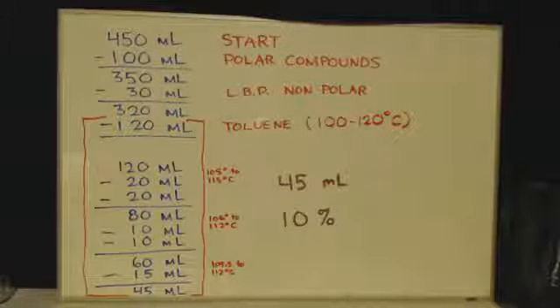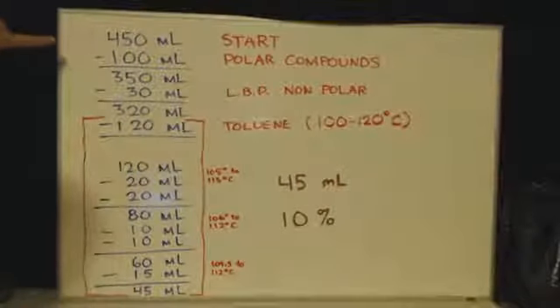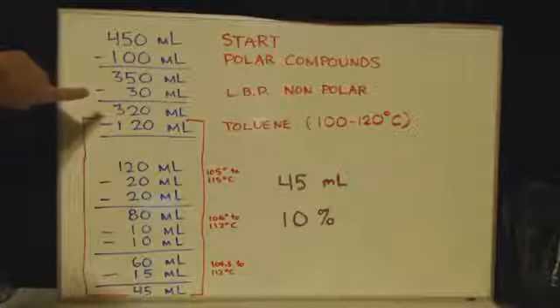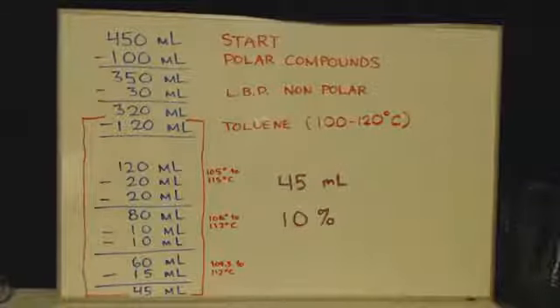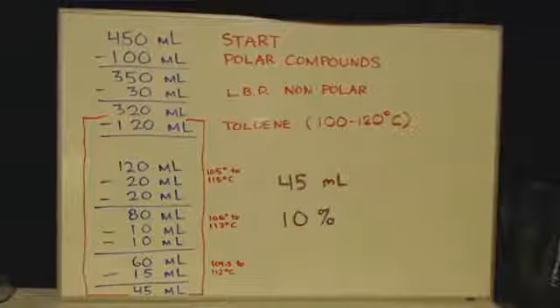Now, I wanted to see what would happen if I did a regular fractional distillation instead of an azeotropic one. As you can see, I started out doing the same exact things. I got rid of the polar stuff. I distilled off the low boiling stuff. Now, right here in these brackets, that's where it changes. Now, I didn't throw in the methanol. I just kept distilling between 100 and 120 degrees Celsius, and I got 120 milliliters of toluene.